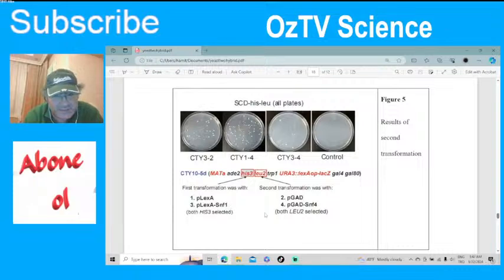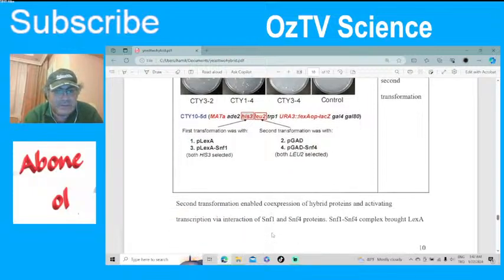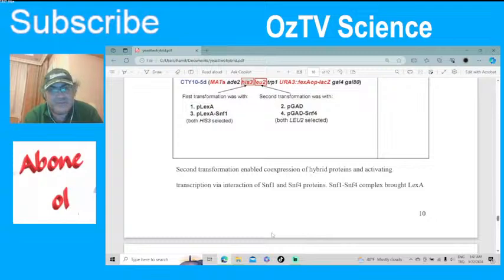If the genes are interacting, SNF1 and SNF4, then you should have a color. The second transformation enabled co-expression of hybrid proteins and activating transcription via interaction of SNF1 and SNF4 proteins. And that's what we were testing. If these two proteins interact, what happens?